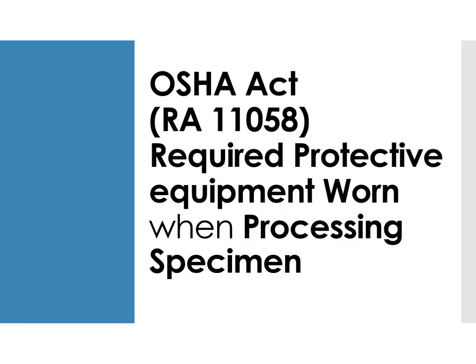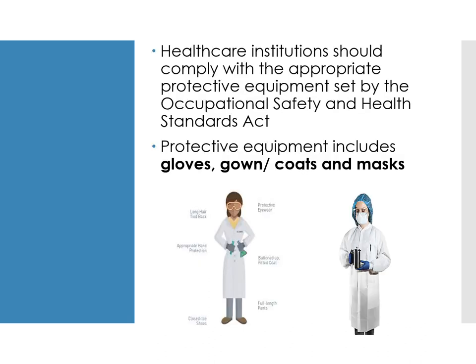Regarding OSHA Act or RA 11058 — the required protective equipment worn when processing specimens — healthcare institutions should comply with appropriate protective equipment standards set by occupational safety and health regulations. Protective equipment includes gloves, gown, coat, and mask. When in the laboratory, your PPE must always be complete — it is for your own protection against diseases and hazards that may be encountered in the laboratory.